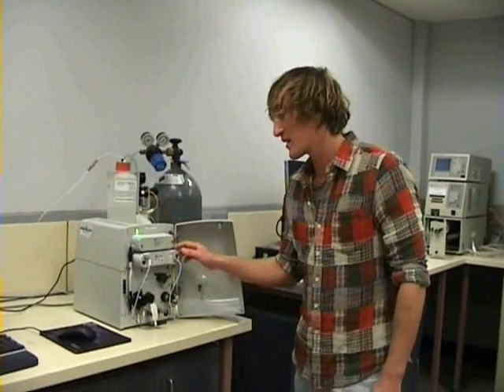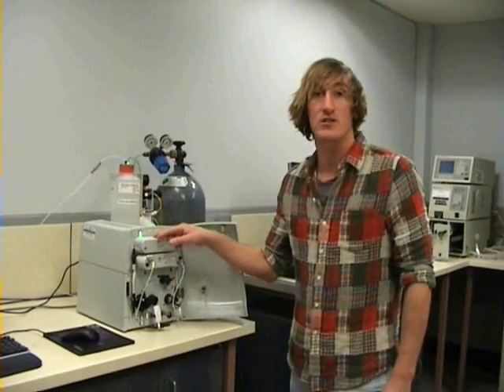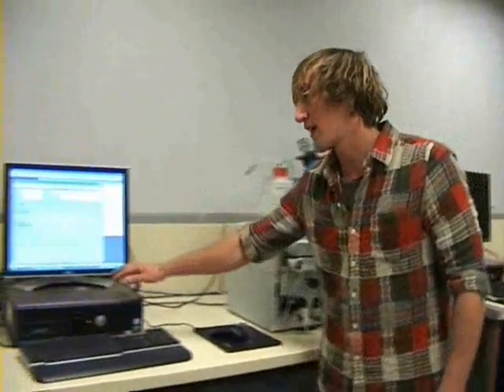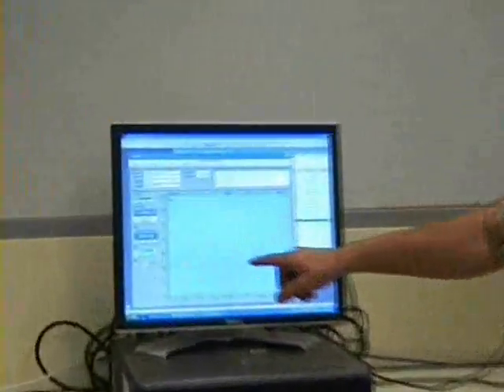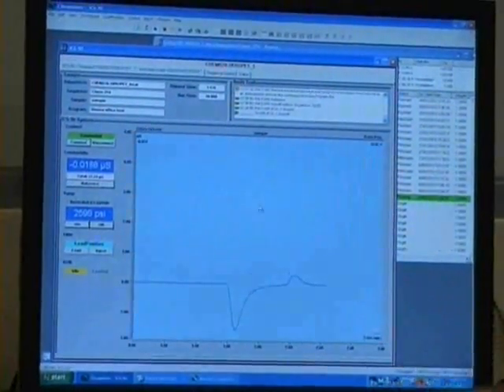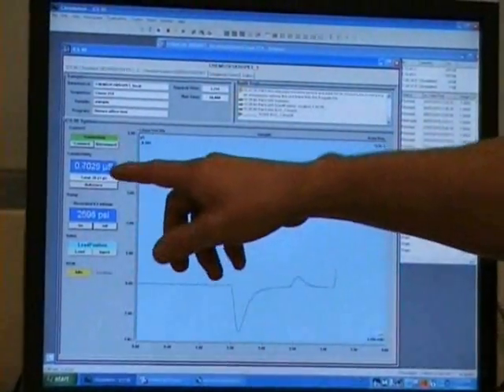After our solution passes through the suppressor, it moves onto our detector. For this particular machine, our detector measures conductivity. Once the conductivity is measured, it's transferred into electrical signals and passed onto our software interface, which records the changes in conductivity and plots them on this graph here. The zero line for our conductivity is generally measured against the background reading of our mobile phase, and conductivity is measured in microsiemens.